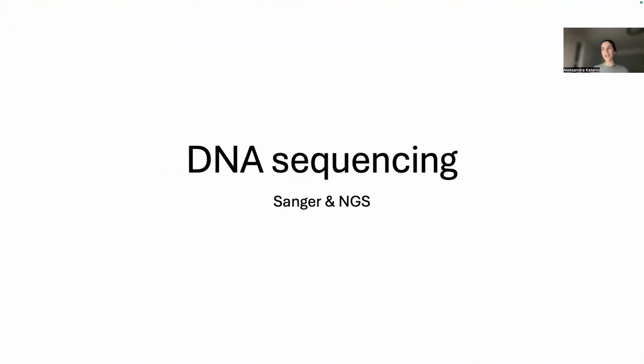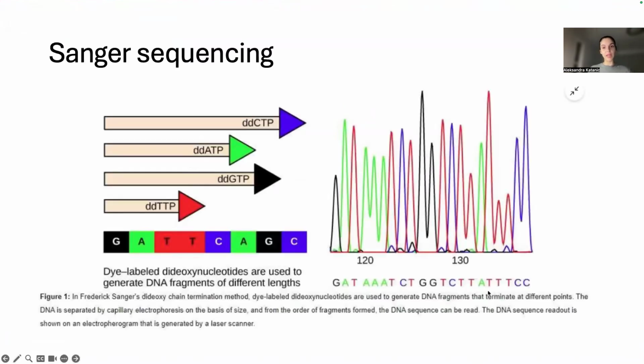Hello, welcome back. Today we are going to go into a little bit of detail about DNA sequencing, particularly Sanger sequencing and NGS. So a little bit of a bigger topic, but I'm sure we can get through it. Let's start with Sanger sequencing.